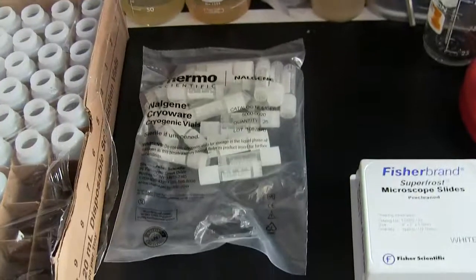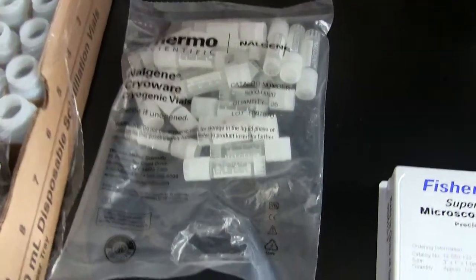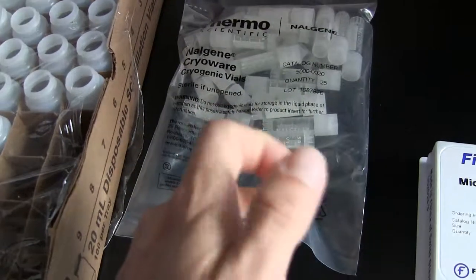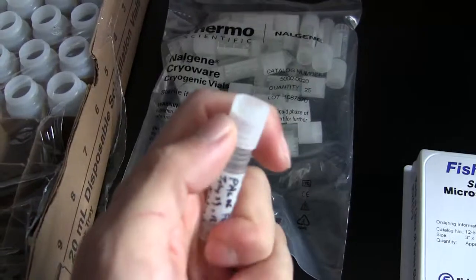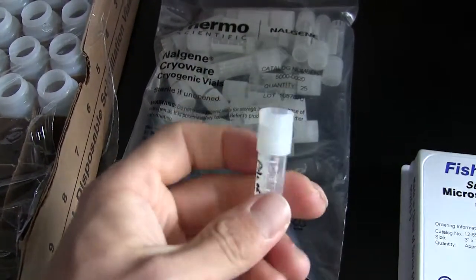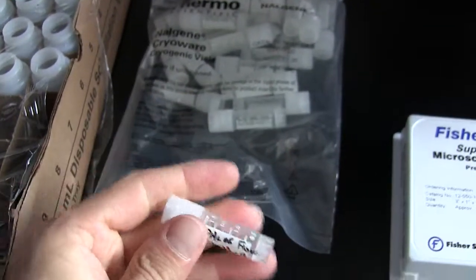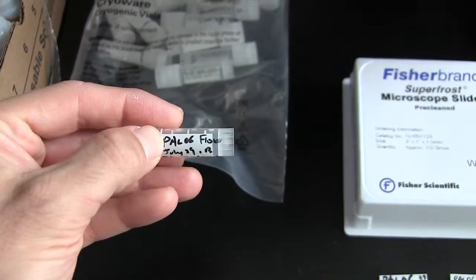Okay, when it comes to flow cytometry samples, we do those using cryovials, which come in a bag like this or whatever bag. Make sure when you look at your cryovial, make sure they unscrew. Okay, if they pop open, that's not the right sample vial to use. That's an Eppendorf tube or something similar, and they often pop open when you drop them into the liquid nitrogen and flash freeze them. So cryovials are screw top, so they're resistant to that popping. Okay, but when we're labeling it, you'll see again we've got the site.